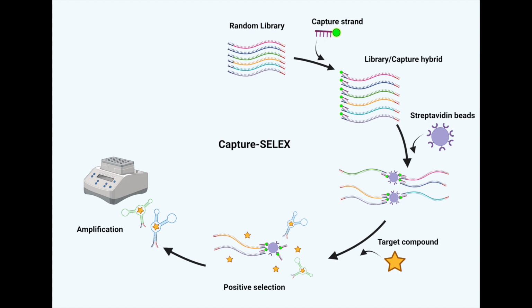Unfortunately, PCR creates double-stranded DNA, so you will have to do a few procedures to make your DNA single-stranded again. That's called regeneration, as well as clean it up, which is purification and concentration. The main regeneration step is a lambda exonuclease digest, and the cleanup steps are a phenol-chloroform extraction and ethanol precipitation. I'm not going to go over the technical aspects of these procedures right now, as you'll go over them more in depth in the lab.